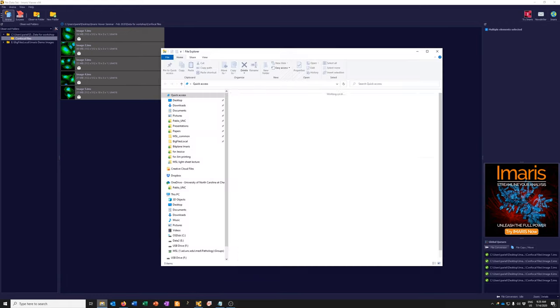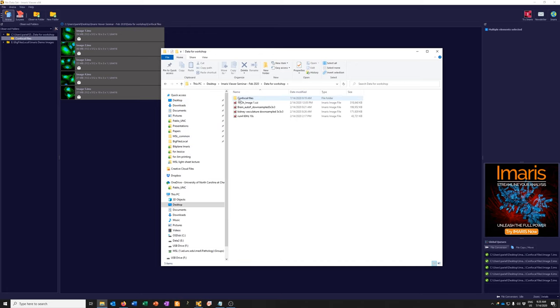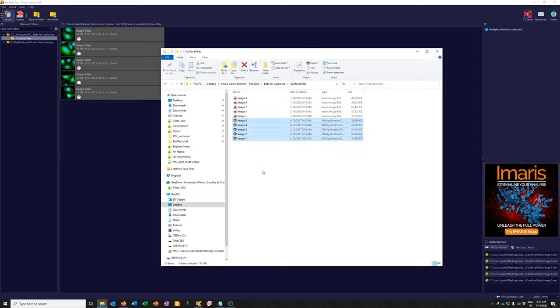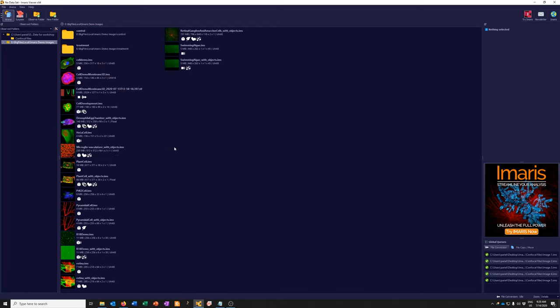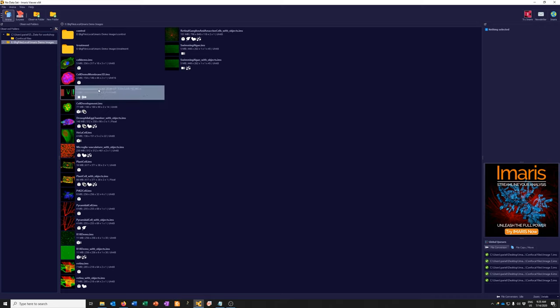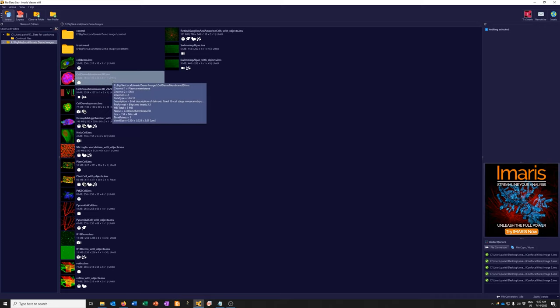Looking at the actual folder, you can see the original files alongside the new Imaris-format files that were just created. Those are the sorts of things you can do in Arena mode — basically explore your data and navigate it in a user-friendly way. Now let's dive into one of the data sets and start looking at the Surpass mode in Imaris.